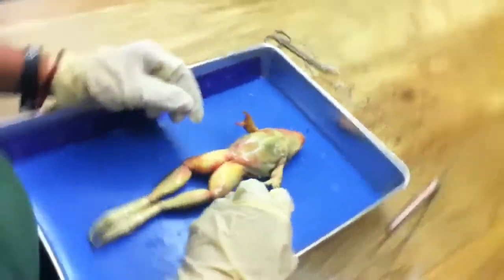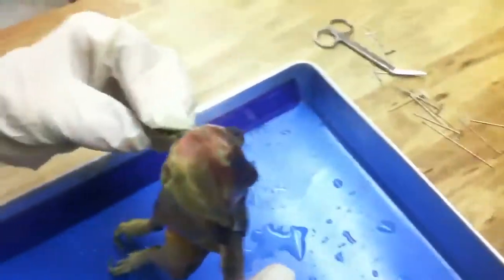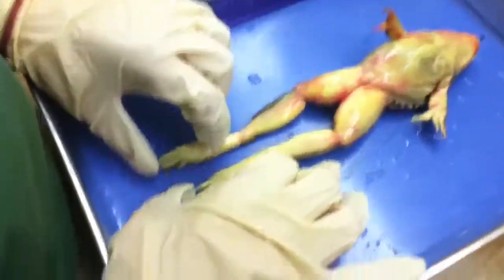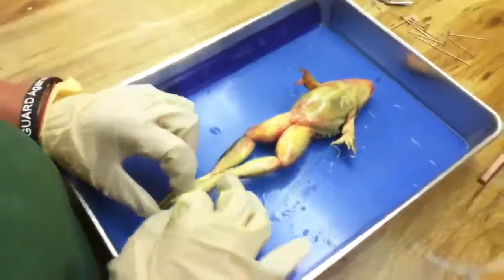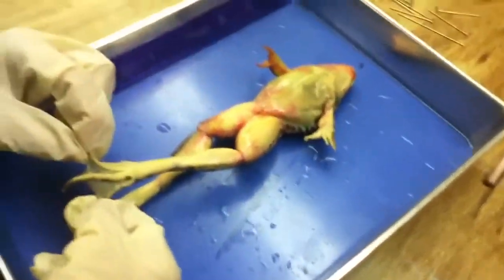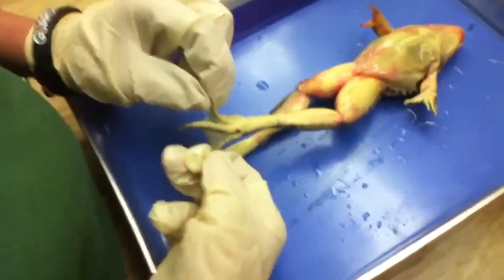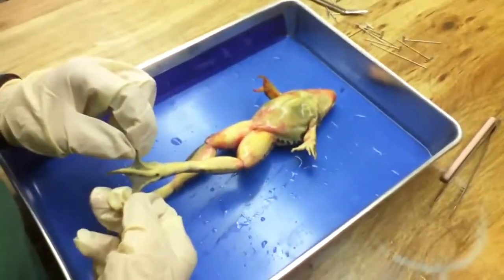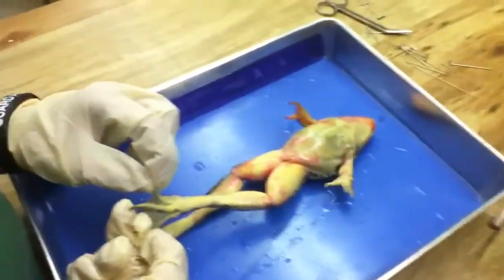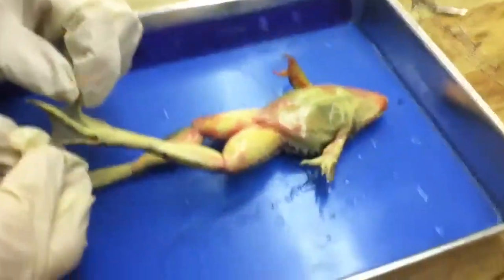Oh, that is really creepy looking. Do it again. Look, you can see its webs. Don't cut them yet. He's flipping you off, Sergio, with his feet. Look at that. Nictitating membrane. Sergio, look at that. He's flipping you off. Let me draw.